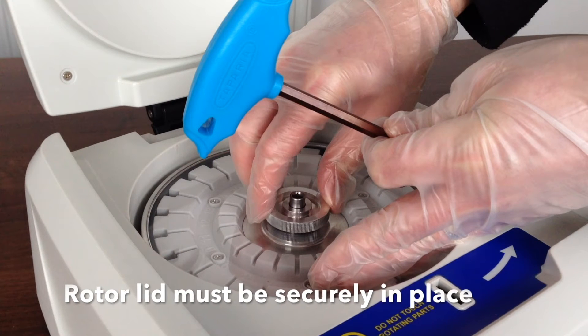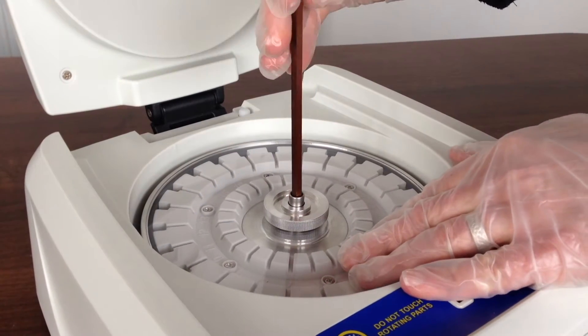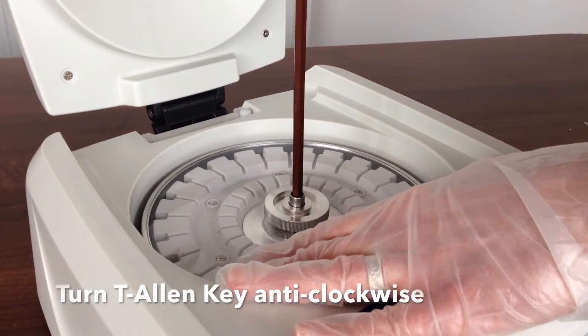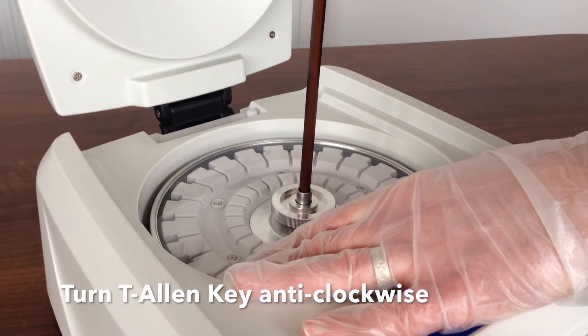Firstly, the rotor lid must be securely in place to facilitate the removal of the rotor. Using the T Allen key provided, loosen the rotor by turning the Allen key anti-clockwise. Do not pull on the rotor — it should come up automatically.